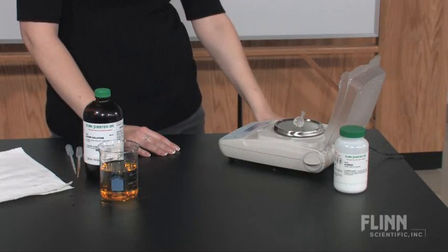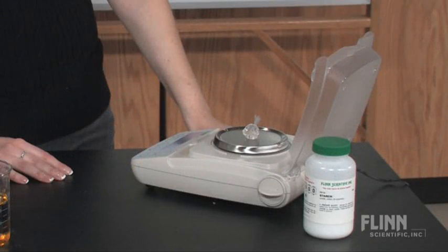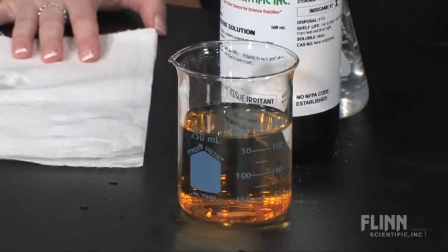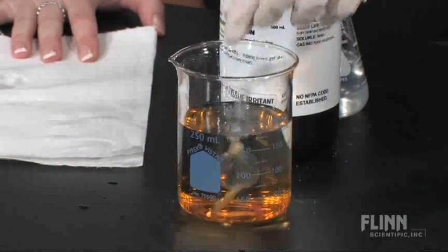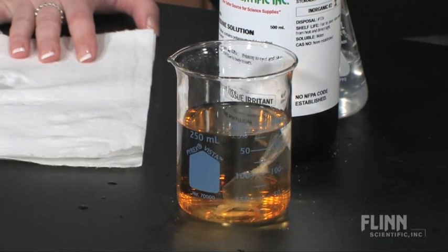Now we want to measure osmosis. Before we place the bag in the iodine solution, we have to gently dry and mass the bag. Record this initial mass because we are going to compare it later. Then place the bag in the beaker of iodine solution and wait 25 to 30 minutes to reach equilibrium.